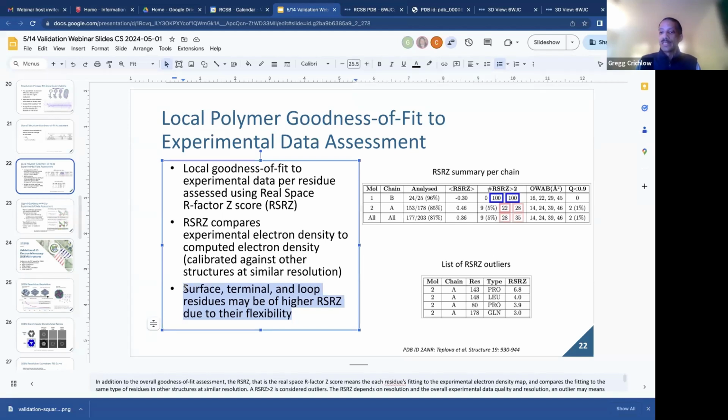That's their decision. We don't make that decision. But you can always download the structure factors and view the map if you ever want to judge yourself. Just to add to Greg's comments, as a crystallographer myself, usually if you look at a region in the electron density map, and the region is kind of flat without much density, it usually means that region is flexible. But if you see very noisy density there, that doesn't overlay with the model, it could mean that the structure model could have been improved. But as Greg said, we don't make that decision.